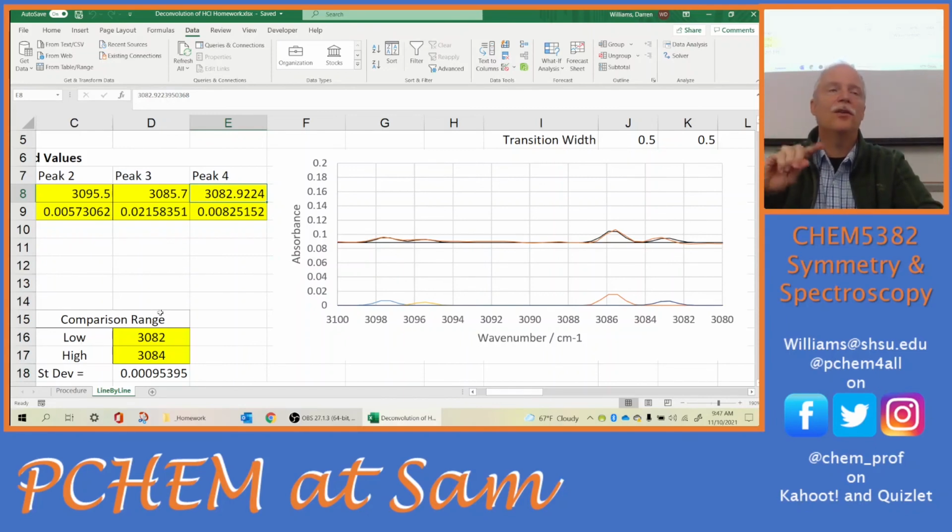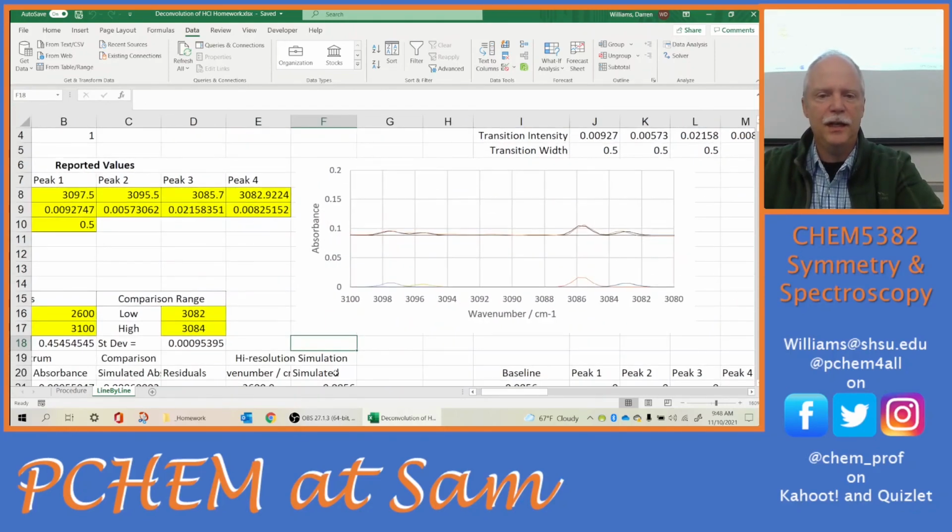Now you can do this over and over again, and when you see your peaks start to broaden out like they're melting, you've gone too far. So you take a before and after picture, and if your peaks haven't changed their height and width, then you're okay at deleting that much data in terms of your Fourier smoothing. You're really just deleting the high frequency noise and then retransforming it. Okay, so that's a bit on Fourier smoothing. But probably not useful for this assignment. No, we don't really have a way to do that in Excel. I've done some Fourier transform stuff in Excel, but I don't have that technique down.